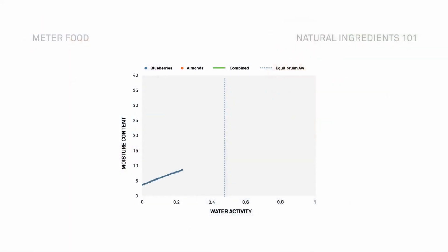Yeah, sure. This graphic that we've been looking at is basically derived from a graphic on the Moisture Analysis Toolkit. This is software that we worked a lot on just this last year, updating it and making it really user-friendly. In that software, there's a mixing ingredient tool that does exactly what we're looking at now. You take an isotherm for each of the ingredients that you're adding. You have to think about which way the water is going to move, so you may want an adsorption curve for your almonds and maybe a desorption curve for your blueberries. But you can use this tool to get the predicted final isotherm that you pointed out earlier in green.